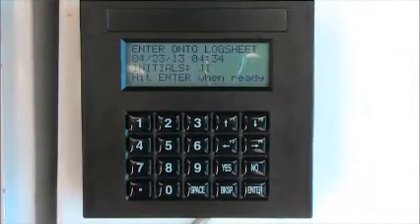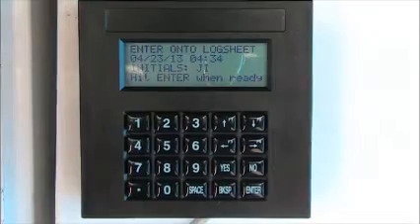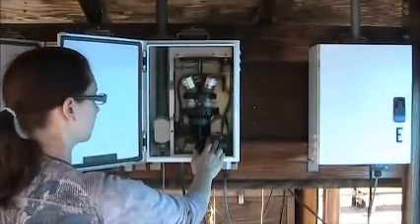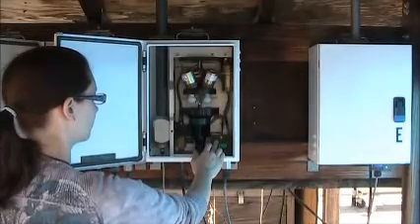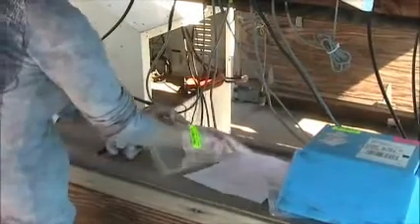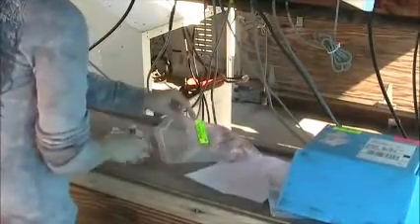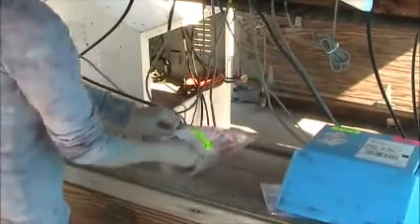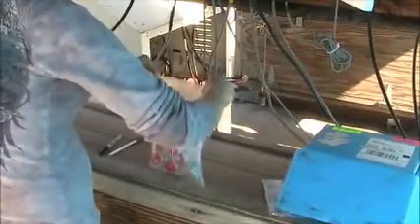The screen should then prompt you to perform a standard sample change. Remove the sampled cartridges and place red caps over the cassettes. The red cap should be in the week 3 bag. Return the cartridges to the week 3 bag along with the completed log sheet. At this time, make sure each week's bag has all necessary components, including filters with red caps and log sheets. The week 3 bag should have the flashcard in it. Place these components into the blue box.